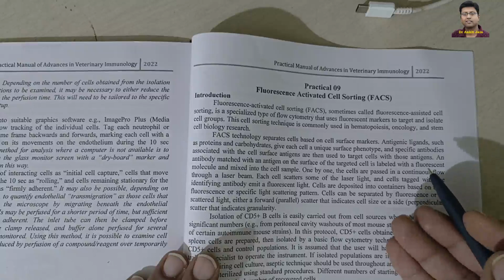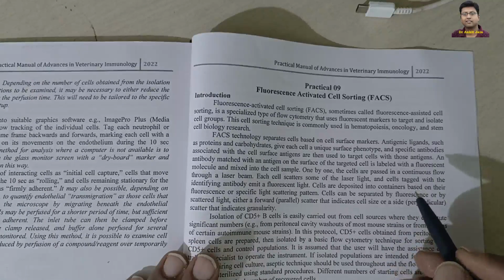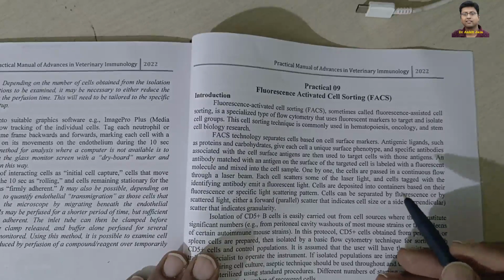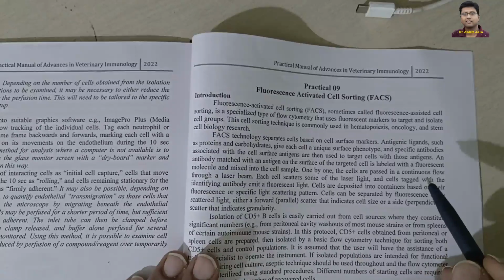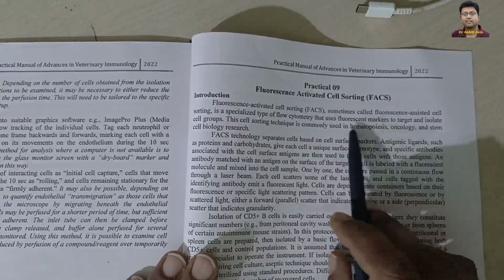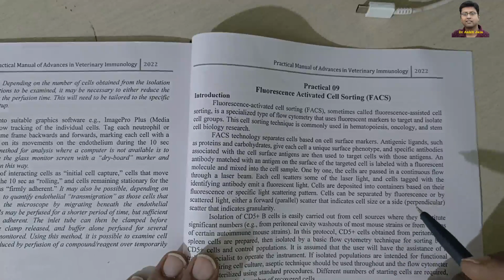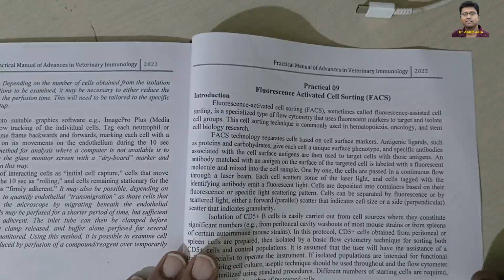So on the basis of the above said antibodies, we have to target these antibodies and we have to separate cells according to their markers which are present on the B cell. What we have to do is add fluorescent material. As we know, fluorescent materials are those which absorb a small wavelength and emit a larger wavelength of light.